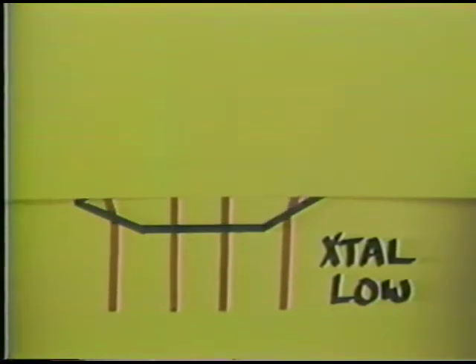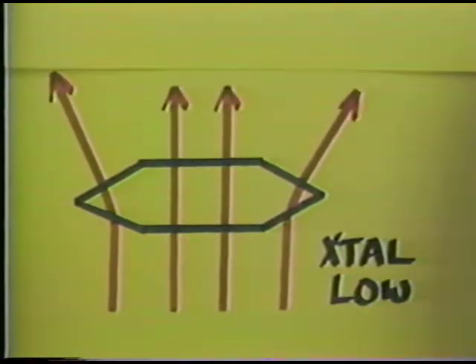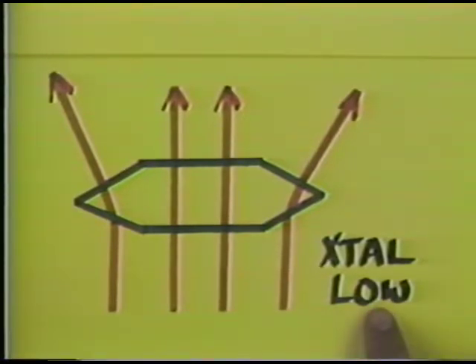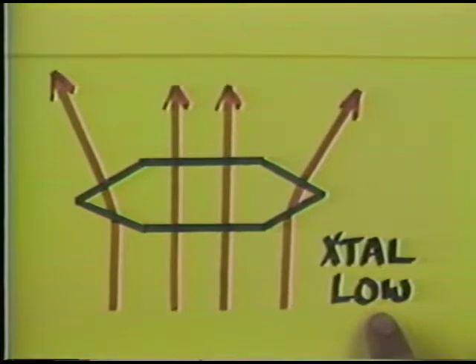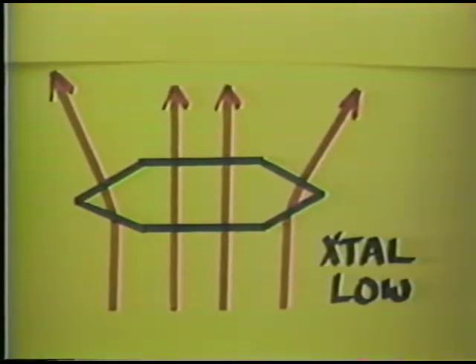If the focal plane is below the crystal, you don't see the effects of the crystal, but as we raise the plane of focus of the crystal, then our perception is that the edge of the crystal tends to move toward the outer margin if the crystal has a lower refractive index than the material surrounding it. So the Becke line, for the case of negative relief, the first example that we looked at, works effectively like this, in that the edges of the crystal appear to diverge when you raise the plane of focus of the microscope.